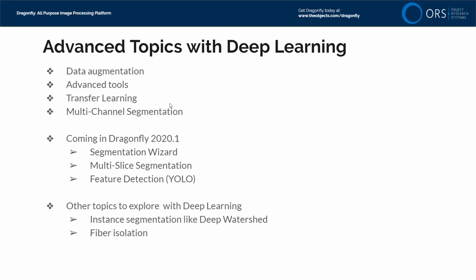Benjamin, or if Nicola is online, somebody take a note. We want, of course, to be able to have a workflow where you can choose, after running a YOLO and having all the box outputs, to automatically apply the crop and have a new stack of cropped particles, either in 2D or 3D. I'm sure, obviously, we've thought about it. It's the obvious workflow, but I don't know that we've implemented it. I don't think we have implemented it yet.